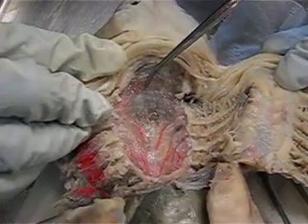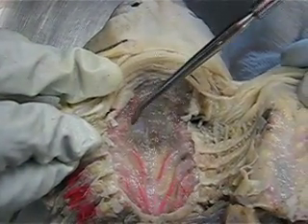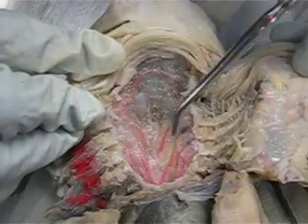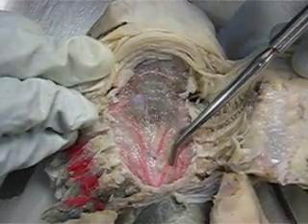Inside, right here, we have the paired dorsal aorta. Right here is the hyoidian artery. The paired dorsal aorta are going to converge into the dorsal aorta, which is going to go down. And here we have some of our five efferent branchial arteries.